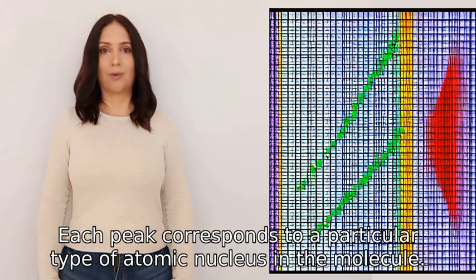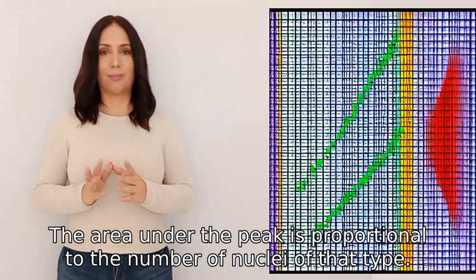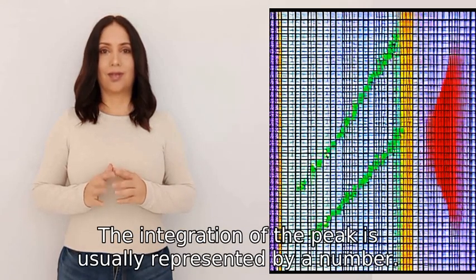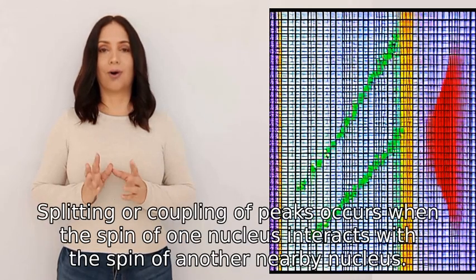The area under the peak is proportional to the number of nuclei of that type. The integration of the peak is usually represented by a number. Splitting or coupling of peaks occurs when the spin of one nucleus interacts with the spin of another nearby nucleus.